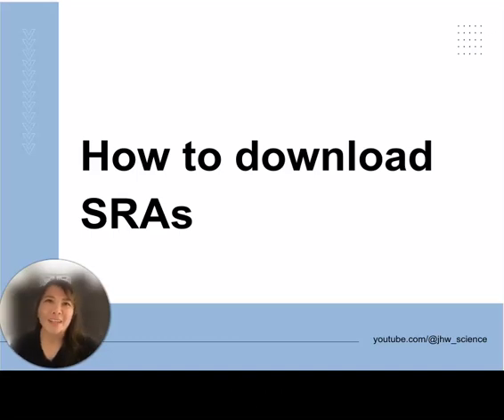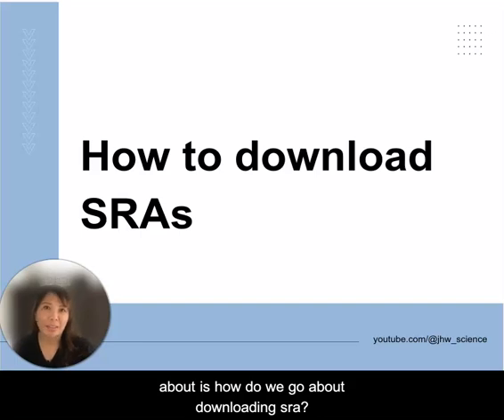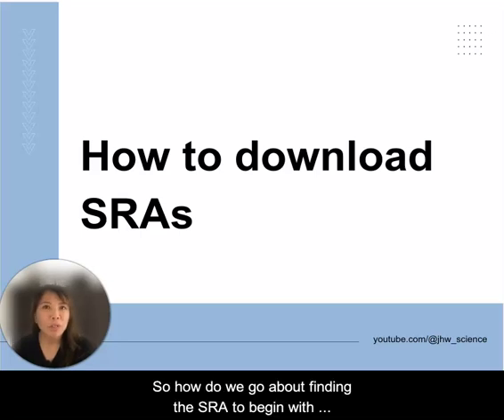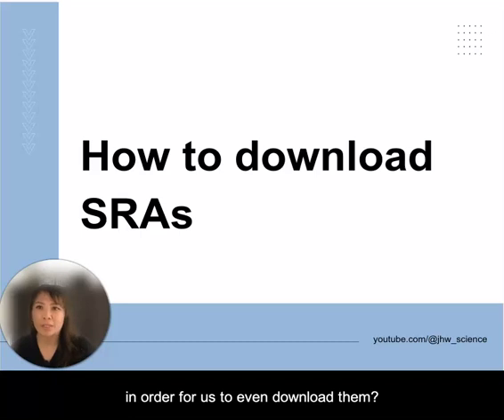Hi everyone! Alright, so today what I want to talk about is how do we go about downloading SRAs. SRA stands for Sequence Read Archive, and these are different data sets. Specifically, the one that we will be working with is the RNA-seq data set. So how do we go about finding the SRA to begin with in order for us to even download them?